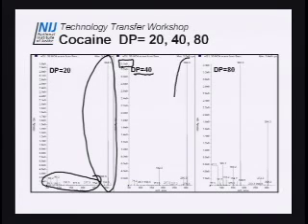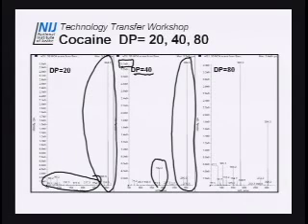I've got a lot of 304. So this is the most amount of 304. But you can see a little 182 has started to sneak in there. What's happened is I've maximized 304, but in maximizing 304, the declustering potential is actually set high enough now. It's actually fragmenting the ion in the source. So my truck full of watermelons has hit a bump just high enough that a lot of stuff, like a tire or a hubcap, has just flown off.